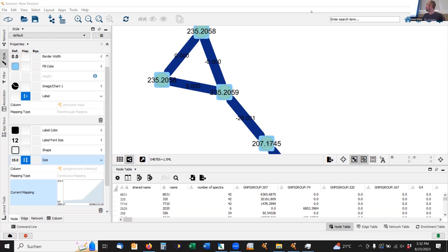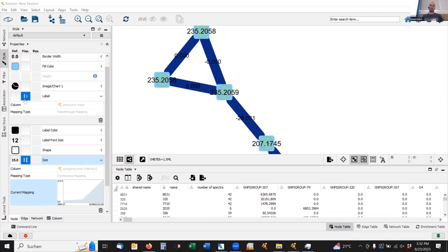You may have seen here in this mapping environment you can select a lot of different things. One general function is that there is a default mapping and then bypass sections. The default value changes the value for all nodes, and the mapping maps the style of a node or edge according to some metadata. And then there's bypassing, which is very useful if you do data exploration in your network.